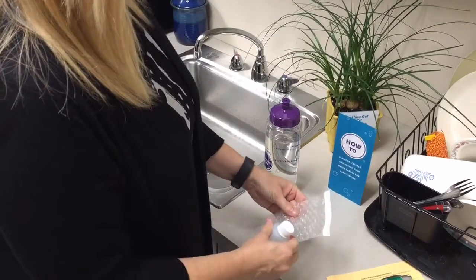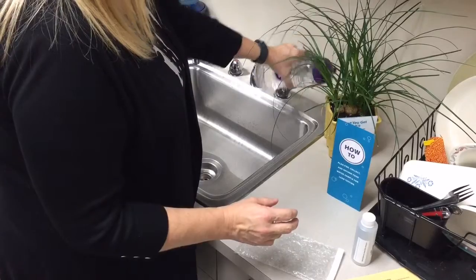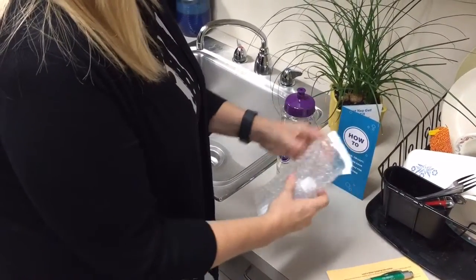Water a plant with the unused water. Return only the small sample bottle in the envelope to the lab. The large sports bottle is yours to keep.